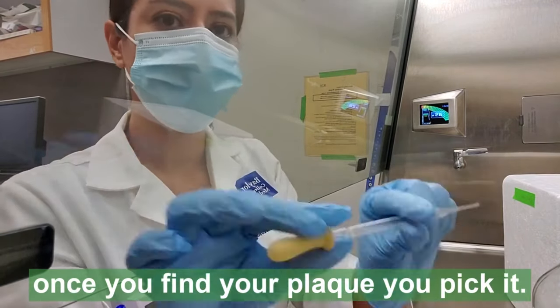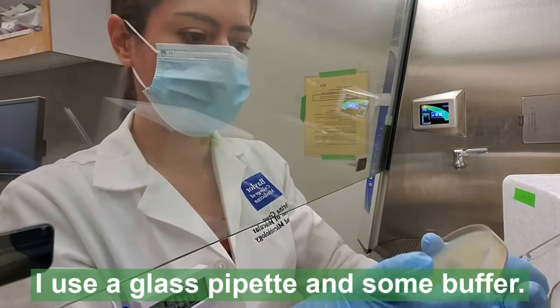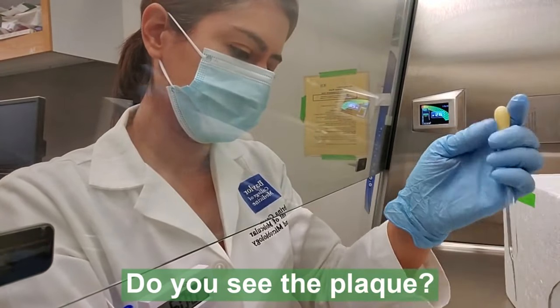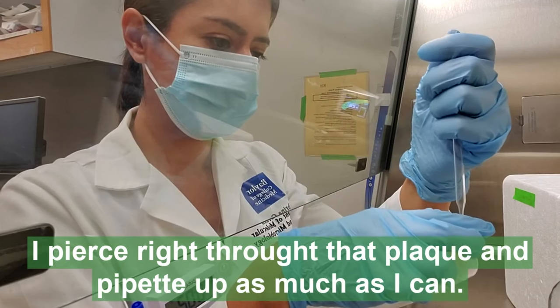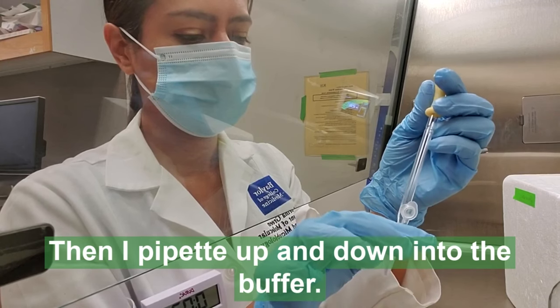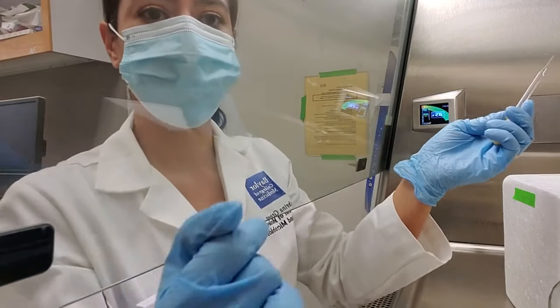Once you find your plaque, you pick it. I use a glass pipette and some buffer — about 500 microliters per plaque. I pierce right through that plaque and I pipette as much as I can. Then I pipette up and down into the buffer. And that's plaque isolation — you can use that to replate and make a lysate.